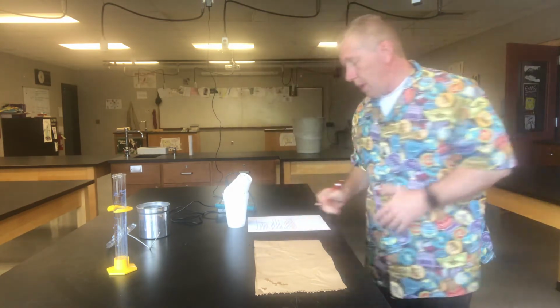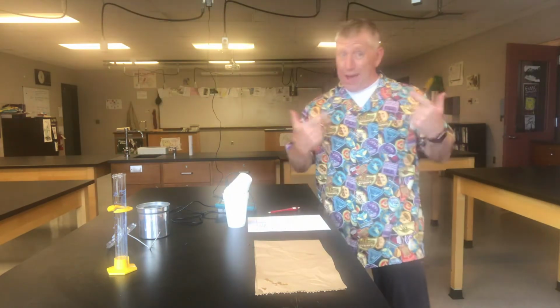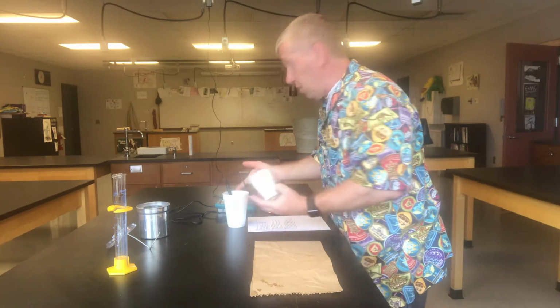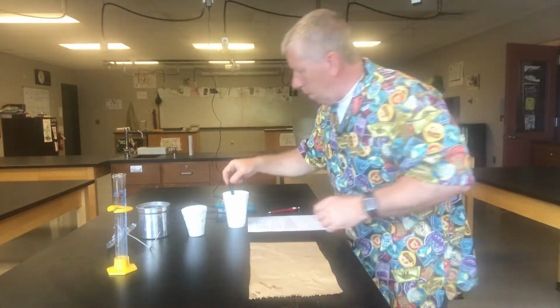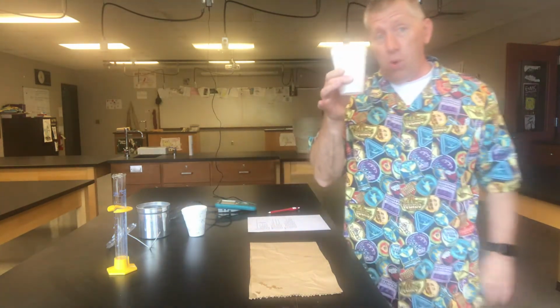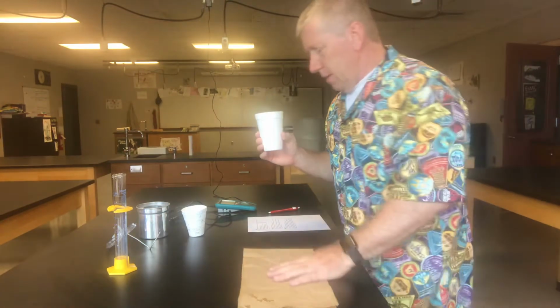Okay. Mass of the water after the ice melts. Now this is where I got to do some sweet skills. The temperature now is beginning to rise a little bit, it's 18.7 because it's warm in the room, so it's warming up our water in the calorimeter, but at this point we don't care anymore because we've got our numbers. We're good. I have to carefully pour. This is where my skill comes in. I'm not a good lab partner really. You're better than I am, lab partner.